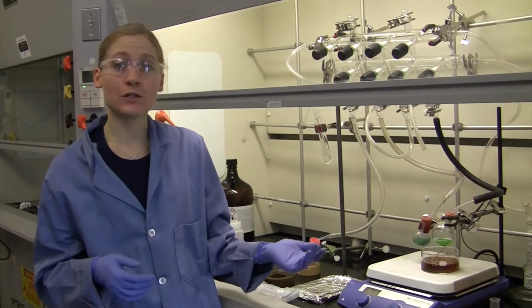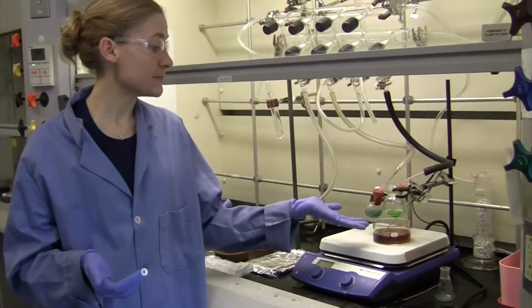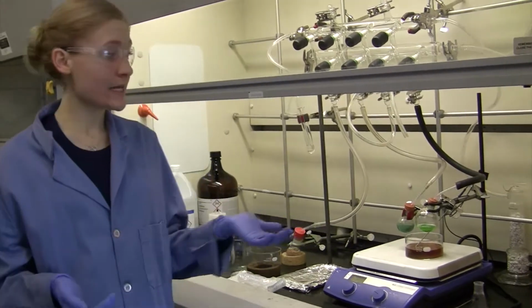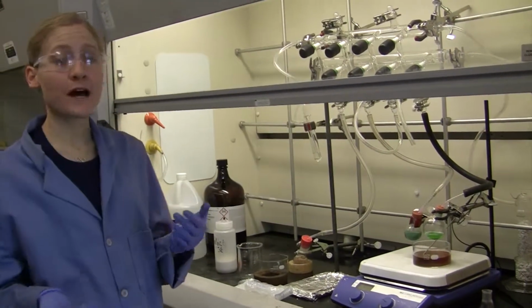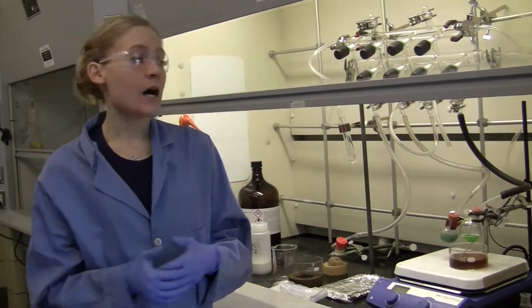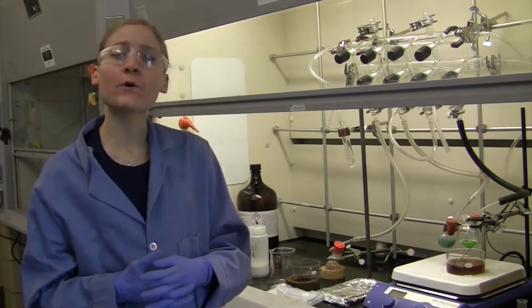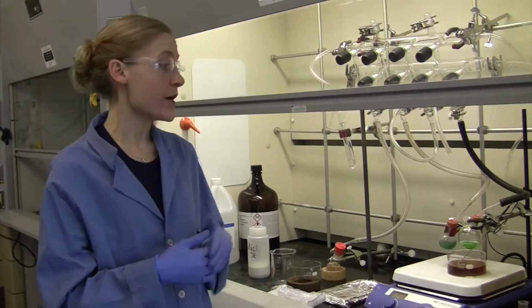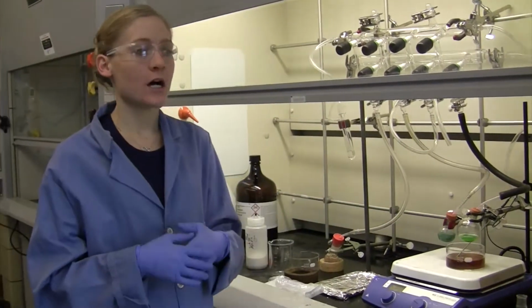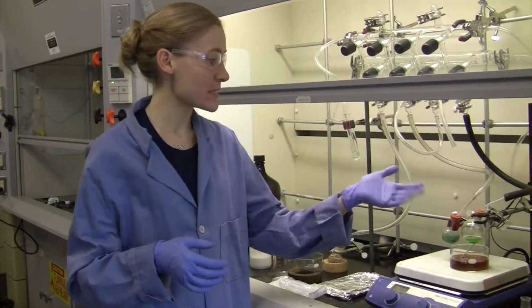The first thing you want to do, which I already did, is pick it up out of the solution where it's stirring. We're heating it at 80 degrees C, but the first thing we need to do to purify it is to add chloroform, and chloroform is a carcinogen. But as long as we handle it in the hood, that shouldn't be an issue. But chloroform boils at 65 degrees Celsius. So if we added chloroform immediately to the heated solution, it would boil up and splash out. And so I just let it cool for a few moments before I did that.